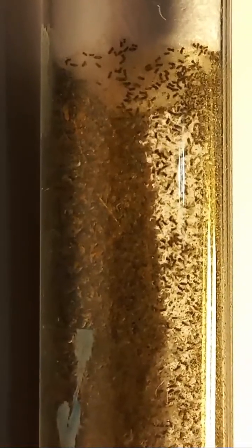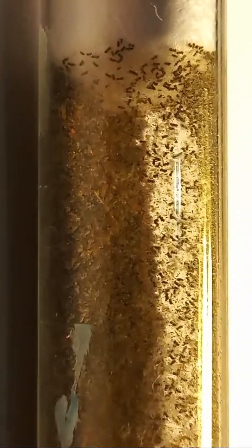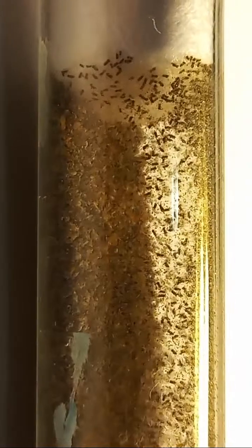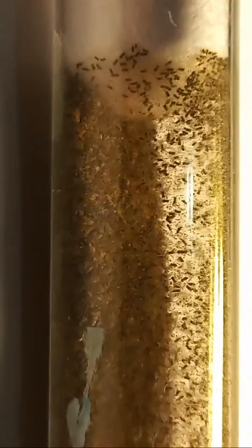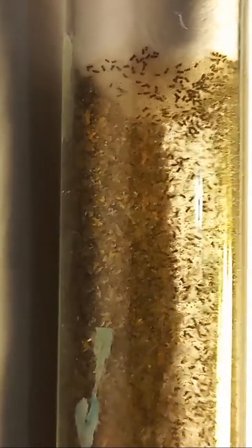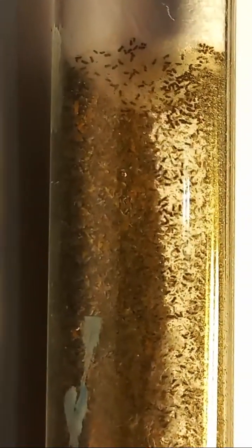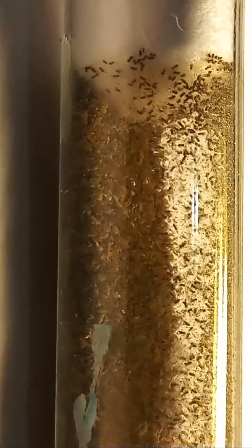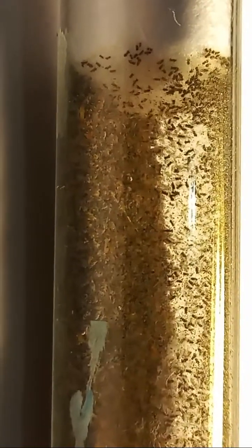I am identifying species which are commercially bred in the laboratory. So it's important to control the laboratory culture, to know what species has been bred. My scientific interest is mixed with their practical interest, because some species are more effective on agricultural fields and some species are less effective.